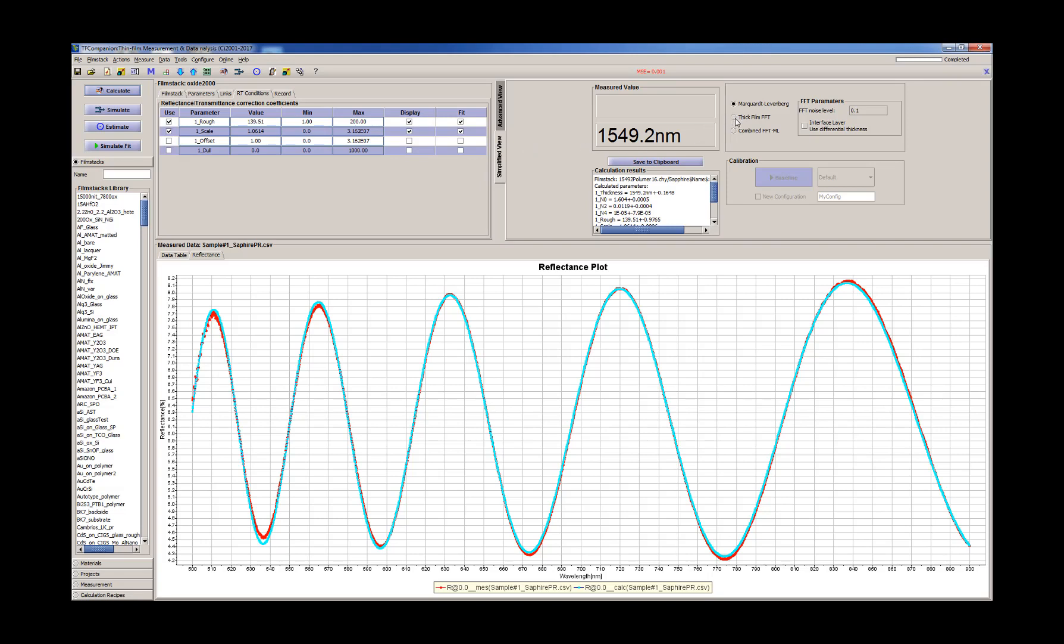So in production environment and for quick measurement, it's always easier to use thick film. So we need now to check if our film stack and settings give the same value when we use the thick film algorithm as with the curve fitting. So we see this 1549.